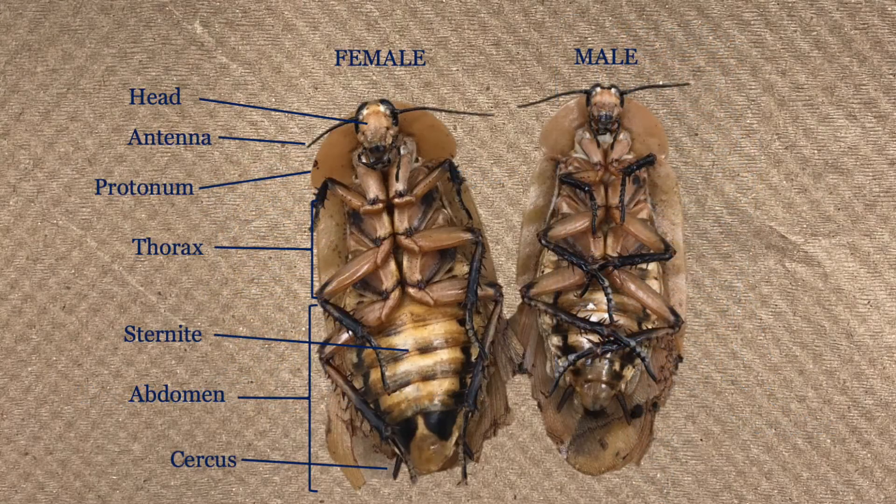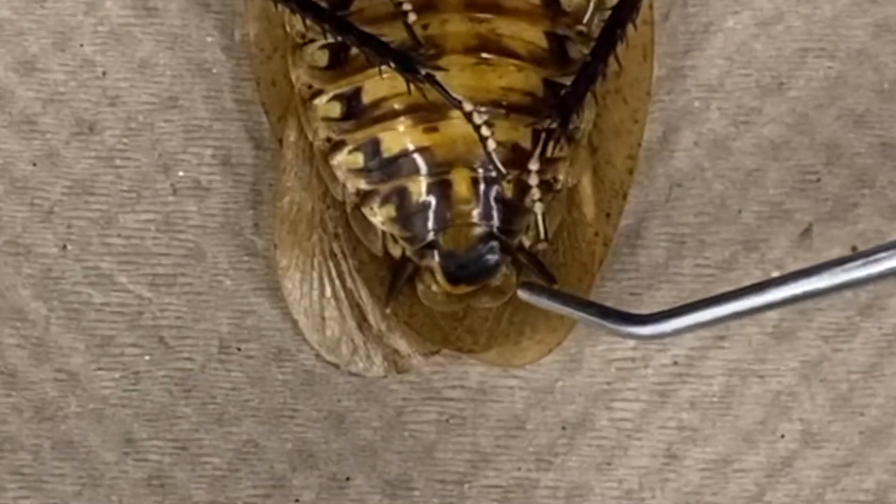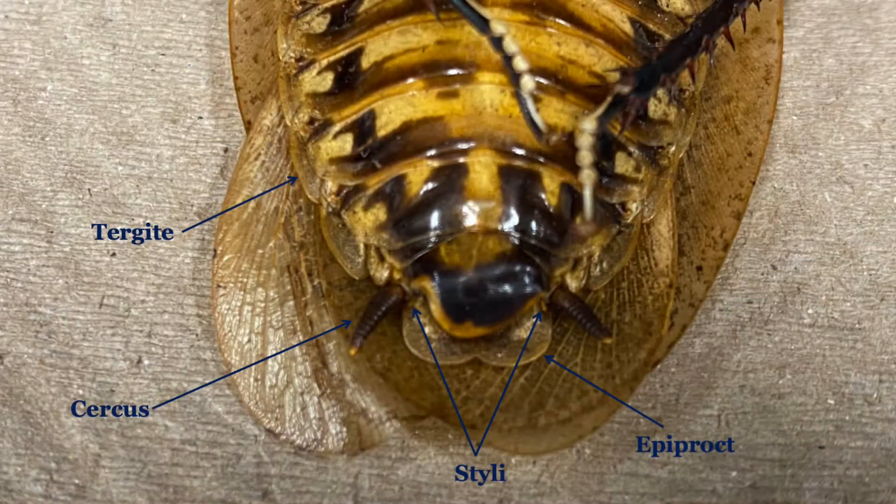The sex of the cockroach can be distinguished by looking at the size, with females being larger and wider, as well as differences at the tip of the abdomen. Both males and females have two sensory structures known as cerci on the epiproct, while males also have two stylus.